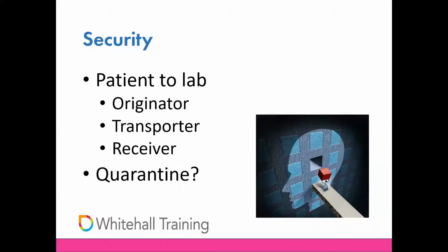And any requirement for this is another detail that should go into the analytical plan. So in terms of the receiver, on arrival at the laboratory, there needs to be some sort of booking in process. Staff should check that the samples are in good condition. They need to be properly labelled, and they need to match the paperwork.